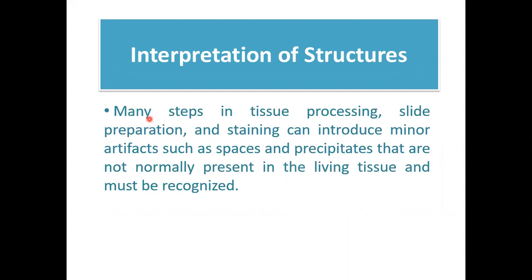So, work ito ng mga histologists or pathologists. So, they can determine if these molecule, for example, seen under the microscope, artifact lang o kaya precipitates lang ng stain natin. Okay? O kaya naman ay merong clinical significance. Baka it means something. Okay? Or it may indicate a disease or cancer. Okay? So something like that.